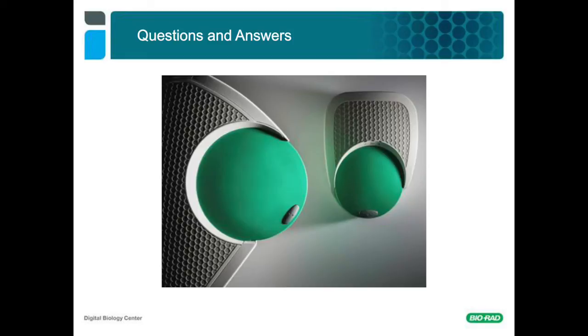And we tried to measure linkage at these distances, and we were successful sometimes, but not successful other times. So we basically had inconsistent linkage measurements, and this isn't a reflection of the technology, just a reflection of the quality of the DNA that we had extracted. So the message we took away from this was if we wanted to go out at farther distances, we would really have to change our sample extraction technique to get more intact DNA.